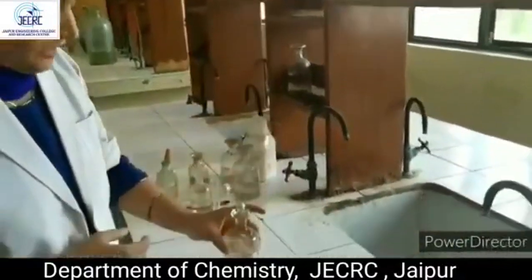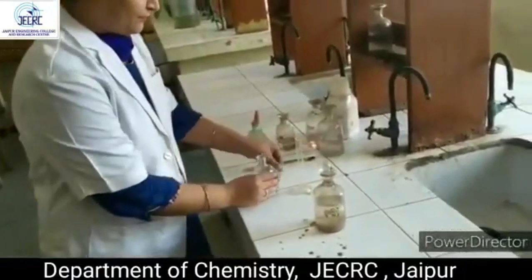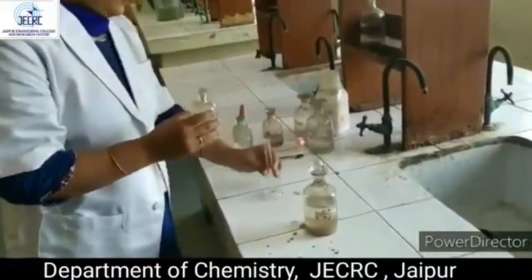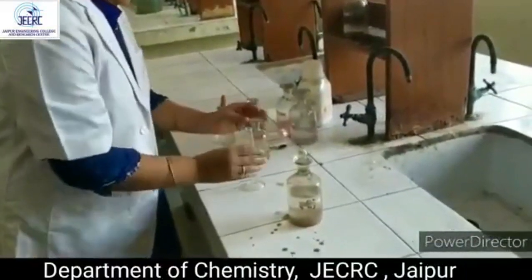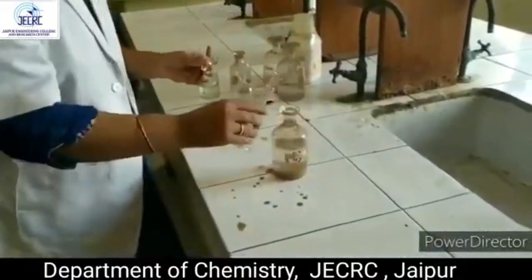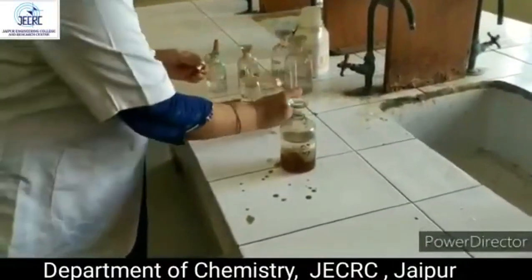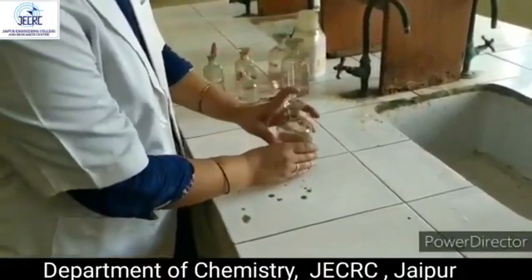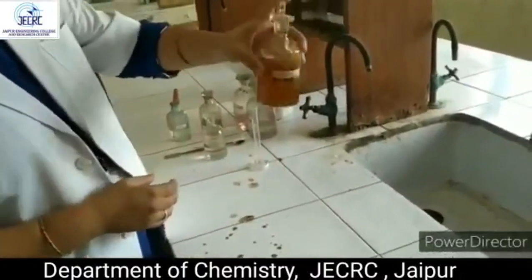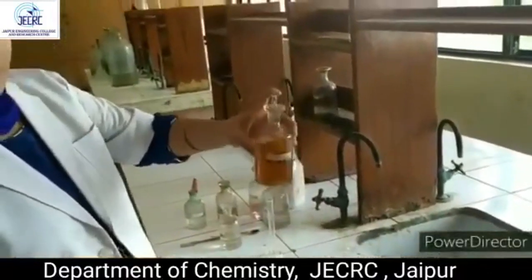Now, in this precipitate, we'll add 2 ml of H2SO4. 2 ml of H2SO4 is taken in the measuring cylinder, and this H2SO4 is mixed in the BOD bottle. Then the precipitate will dissolve. We'll shake it well so that the precipitate which has settled at the bottom will dissolve properly.